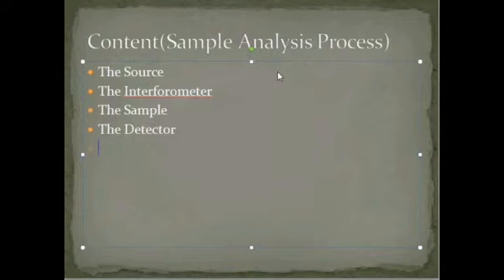And the final step is the computer. The measured signal is digitized and sent to the computer where the Fourier transformation takes place. The final infrared spectrum is then presented to the user for interpretation and any further manipulation.